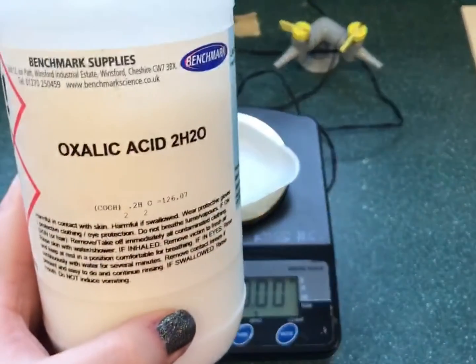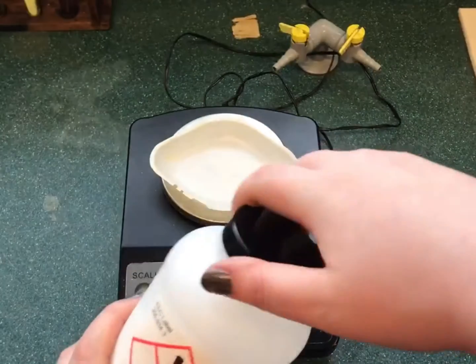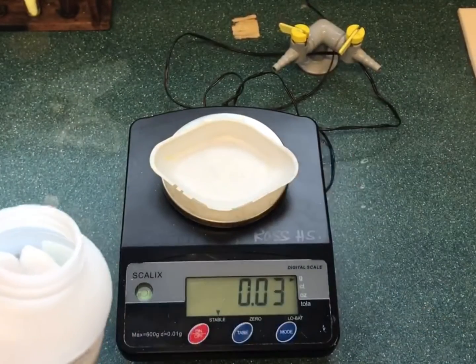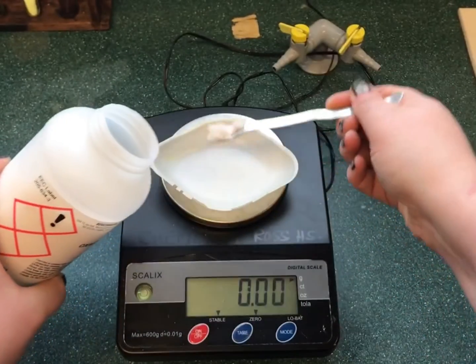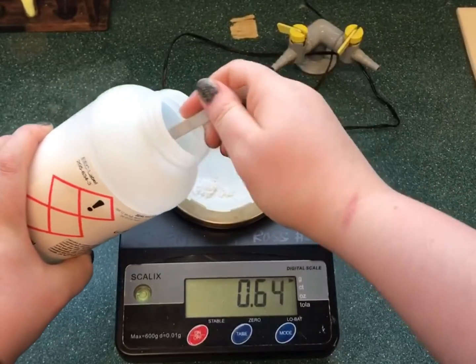To do this, a primary standard should be used. A primary standard is a chemical which is highly soluble in water, has a high gram formula mass, does not absorb water from the atmosphere, and is available in high purity.